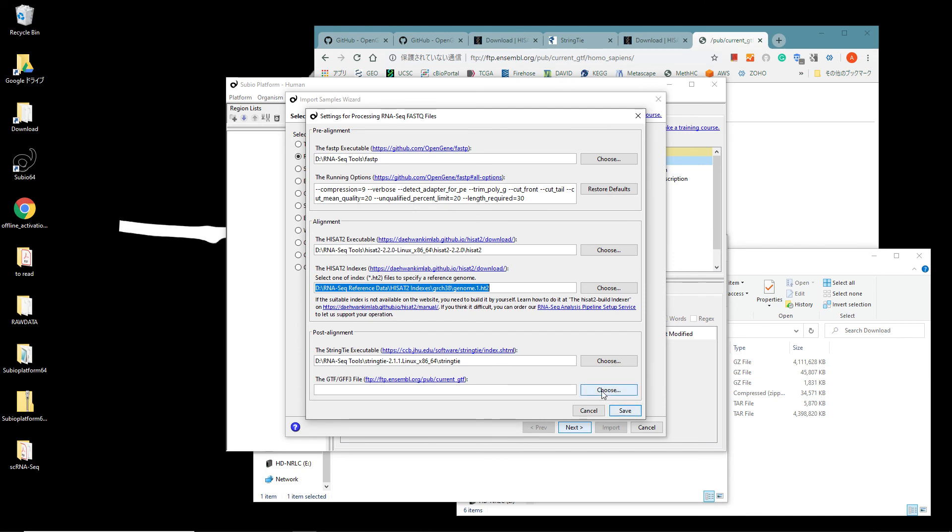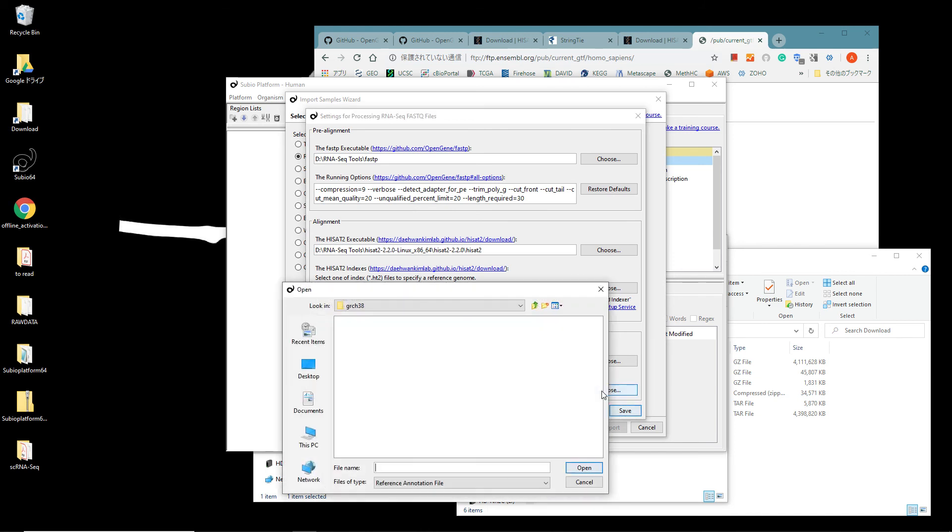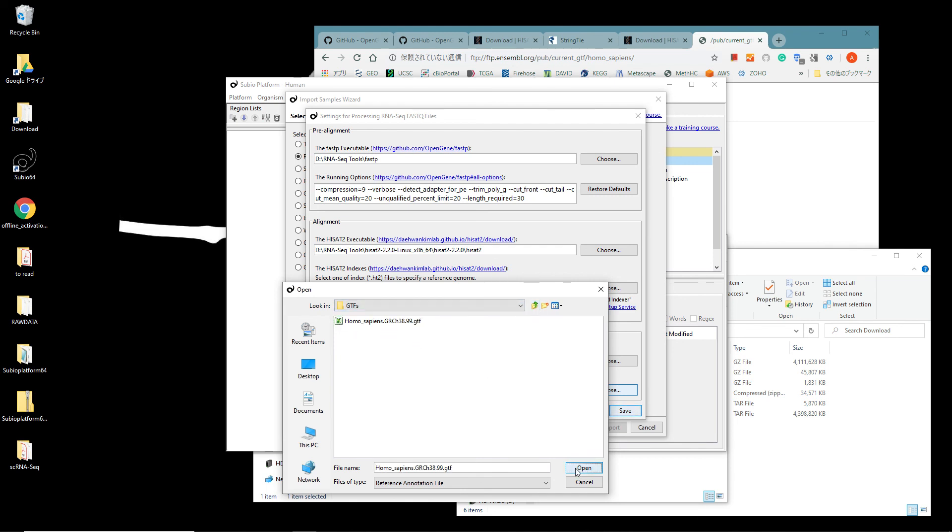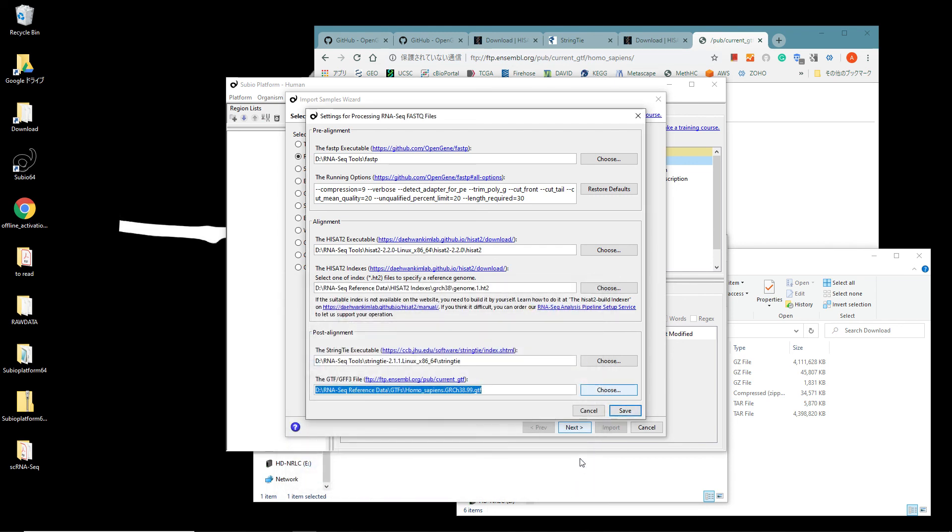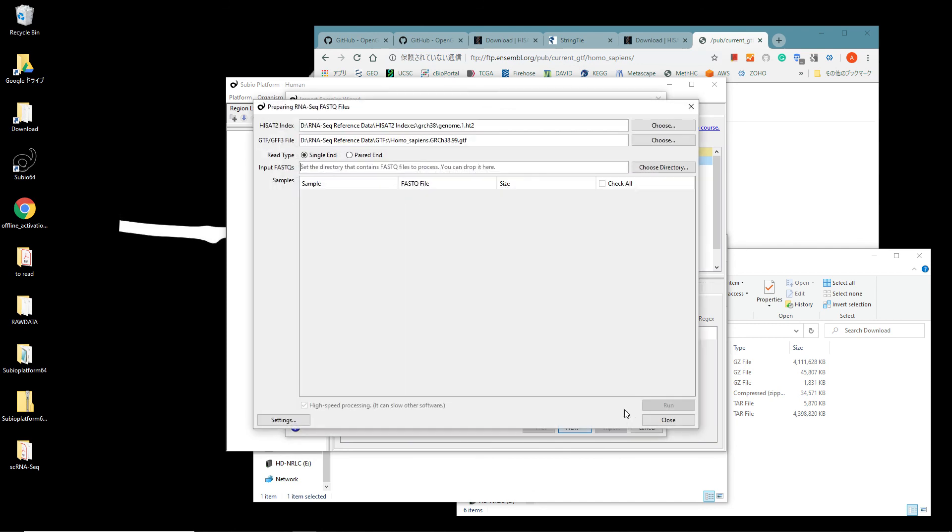Go back to the Subio Platform's setting panel. Set the path of the .gtf file at the GTF GFF3 file section. That's all. Click the Save button.